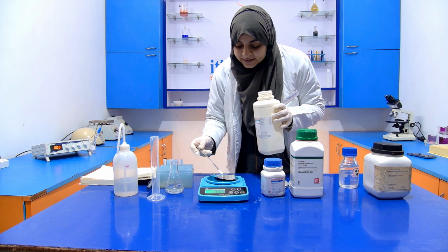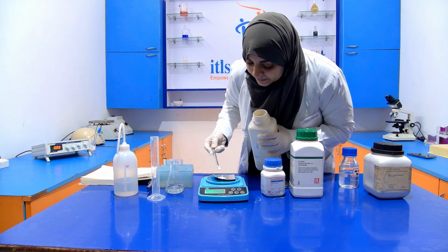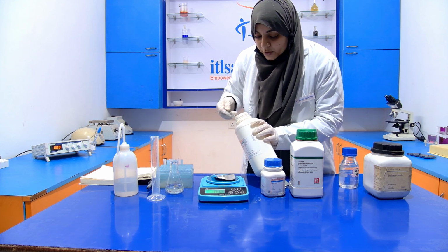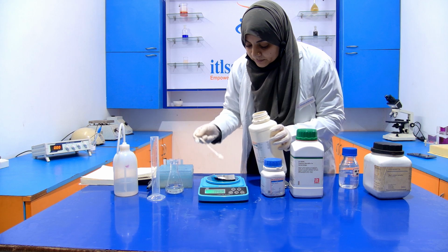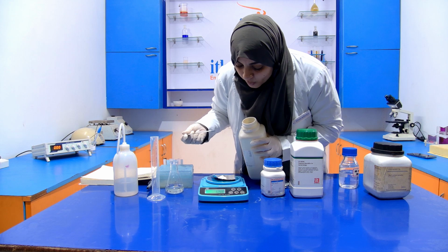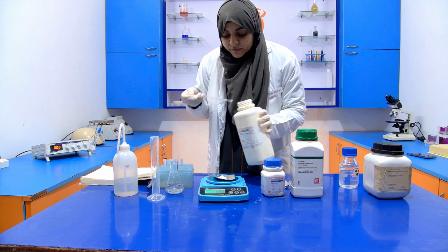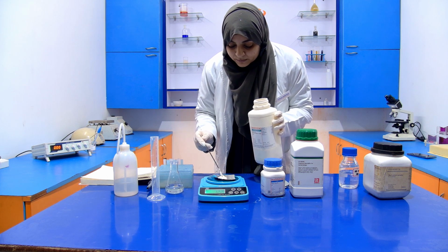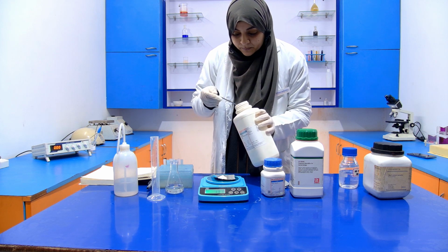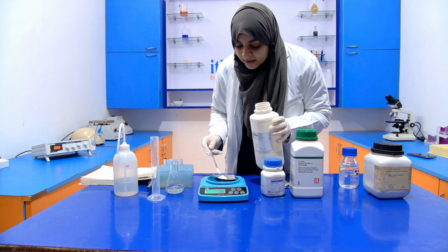So we have to take an exact weight. It is around 0.42. Now again I am going to add this agar into it. Now it is 1.20, but we require 1.5. Again I am going to add. It is 1.34. We have to add until it reaches 1.5.